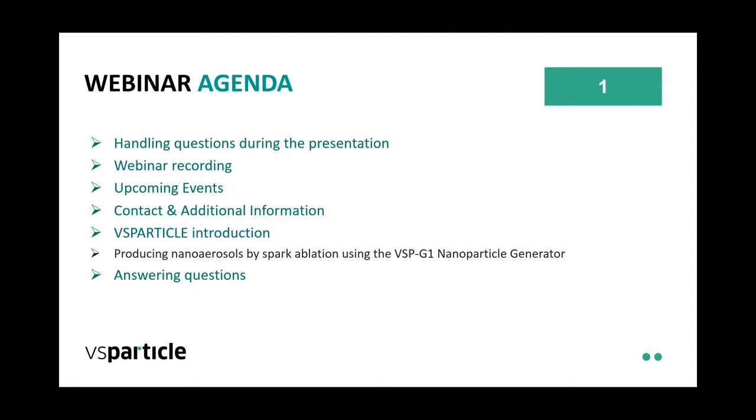The topic will be an introduction into several basic aerosol processes related to the generation and transport of nanoaerosols. The generation of aerosols by spark ablation is presented in the context of these processes, and several use cases in test emissions, nanoparticle exposure, and toxicity studies will be discussed. The last part of today's webinar will handle your questions.